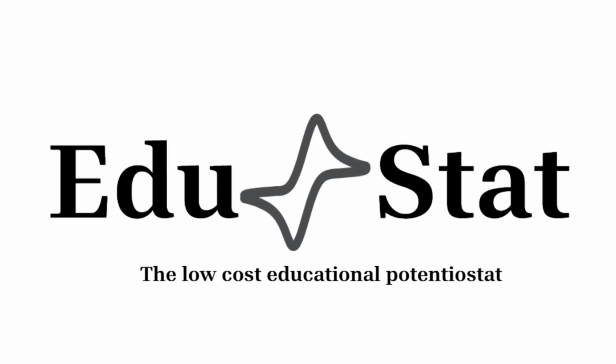We are the EduStat project, developed in the Integration Workshop 3 course at Universidade Tecnológica Federal do Paraná. Our goal was to create a low-cost educational potentiostat to make this technology more accessible, especially for beginners who have never had contact with such equipment.